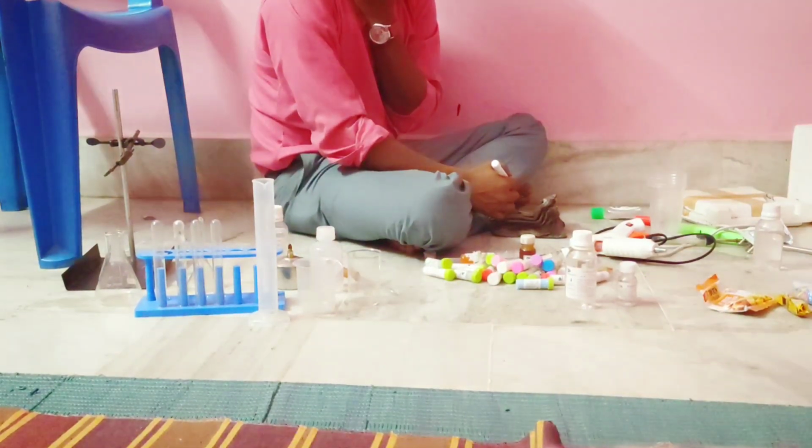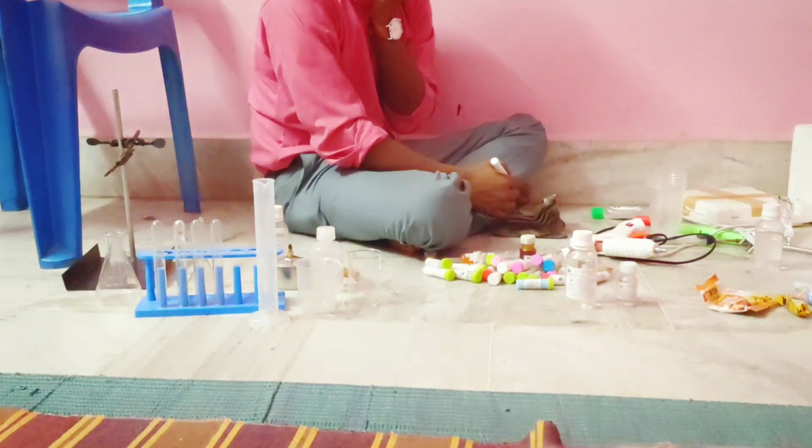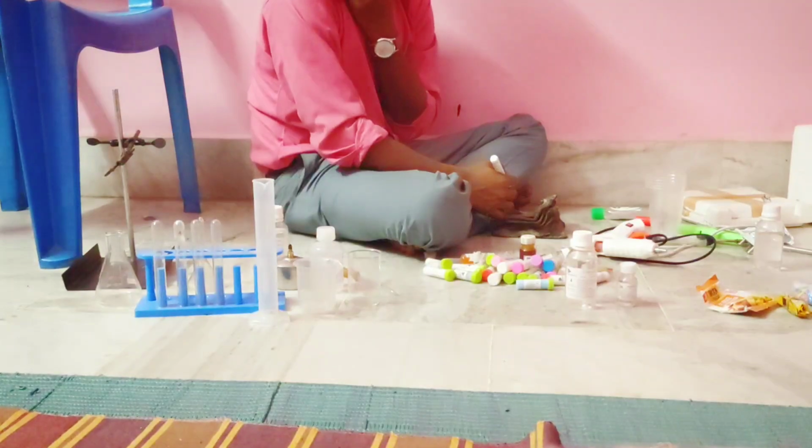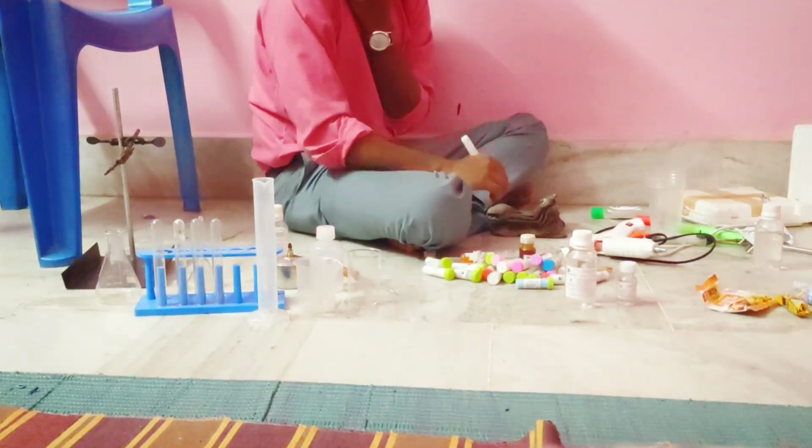But actually, no, definitely it will not take time, but it will take some amount. It will take some amount actually.